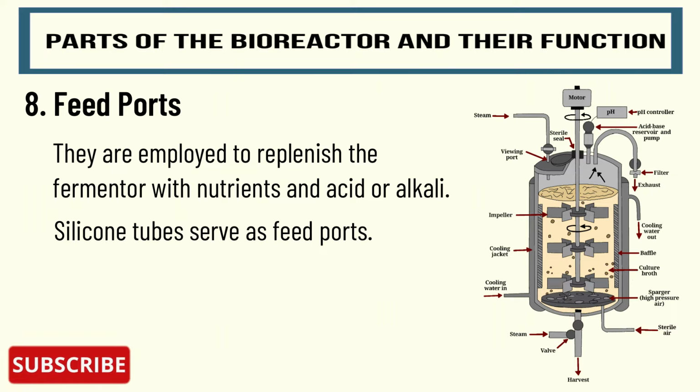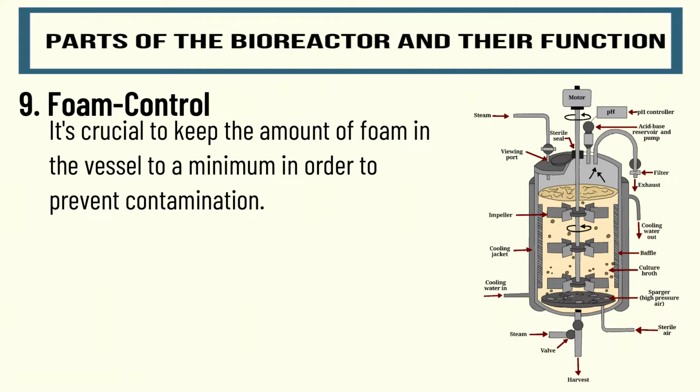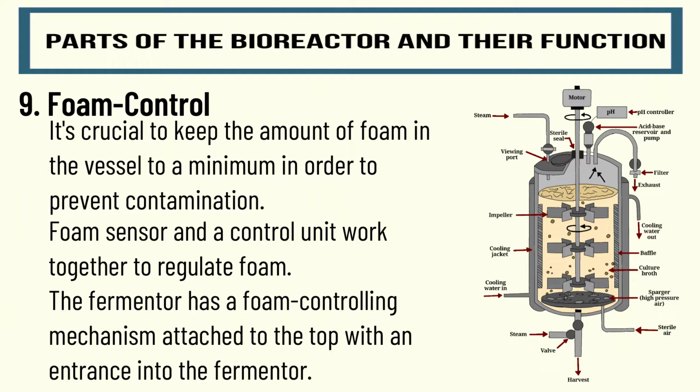Number 9. Foam control. It's crucial to keep the amount of foam in the vessel to a minimum in order to prevent contamination. A foam sensor and a control unit work together to regulate foam. The fermenter has a foam controlling mechanism attached to a top with an entrance into the fermenter.